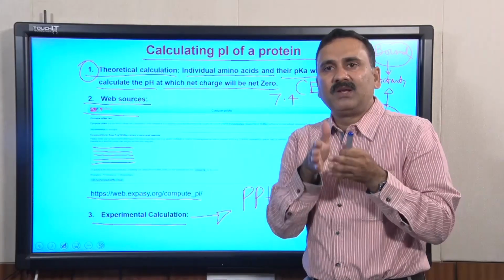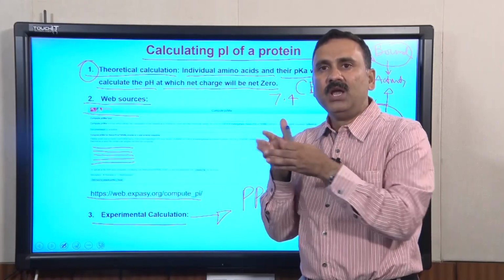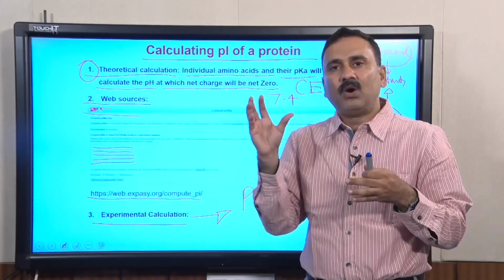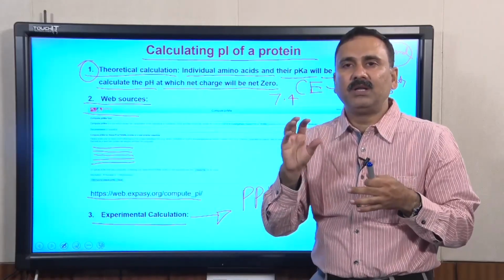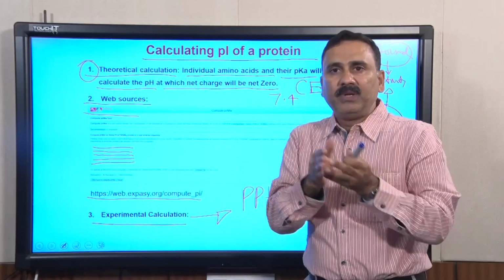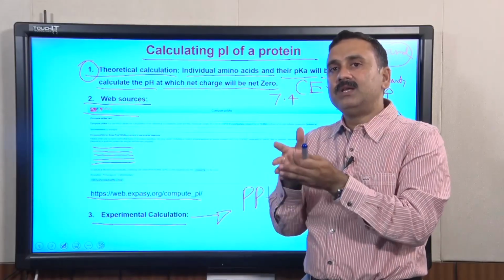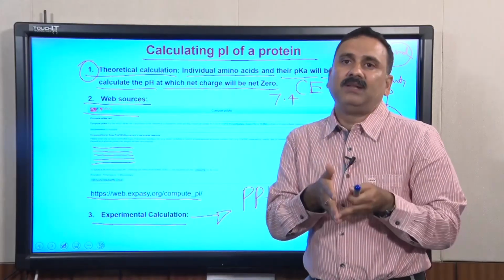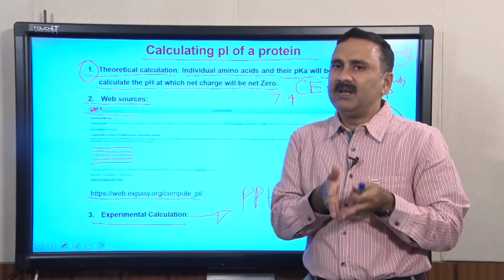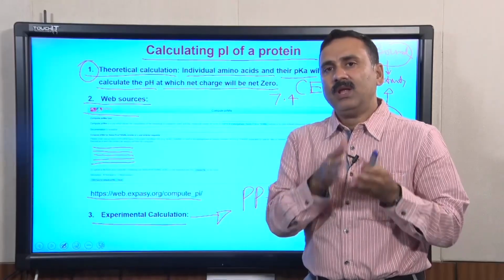As soon as the protein starts coming out of the solution, it forms particles, which means it is no longer soluble, and that is how it gives you more and more scattering. The pH at which the scattering is highest is the pI value, and that is how you can calculate the pI values very precisely.